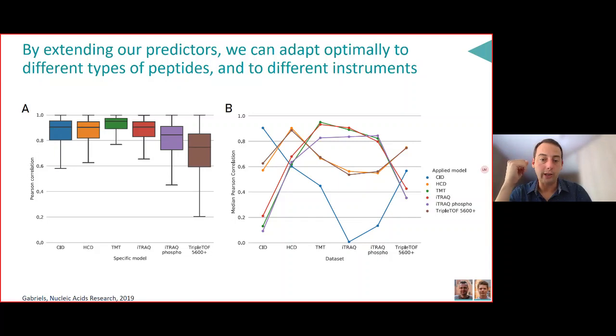What is quite crucial, however, is the retention time. So the accuracy of the retention time prediction is a key feature. And so there you have 2 factors. You have the accuracy of the algorithm itself and the calibration of that algorithm to specific LC setup. So this is in generic terms. Again, we haven't tested it against Spectronaut specifically.